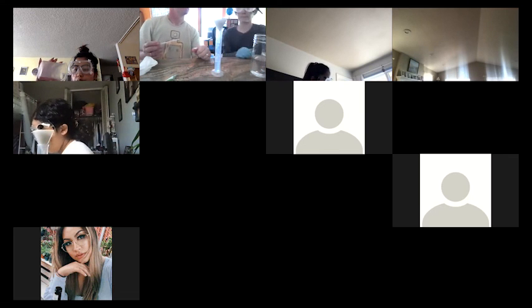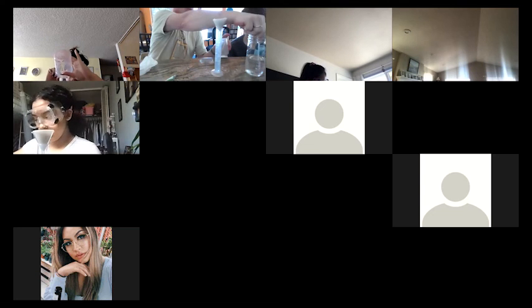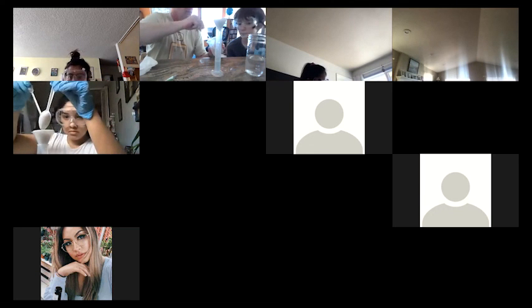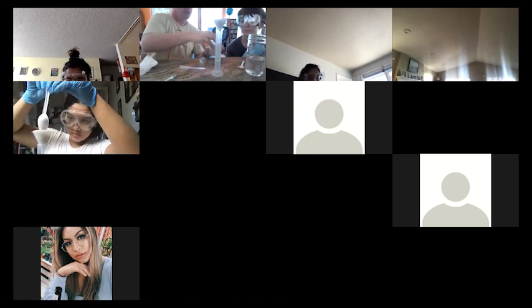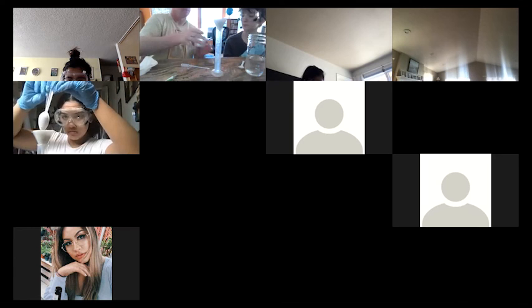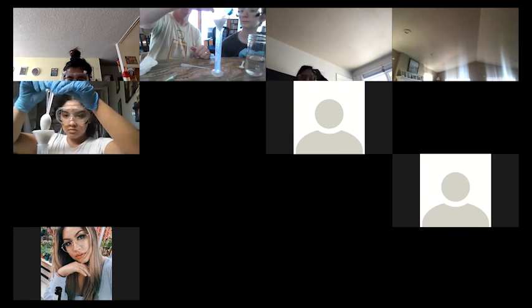There you go. Great job. So if there's any left, basically squirt the side of it. We can also squirt the spoon because there's also some on the spoon. And swirl, swirl, swirl. Dump, dump kind of quickly so that the, there we go.